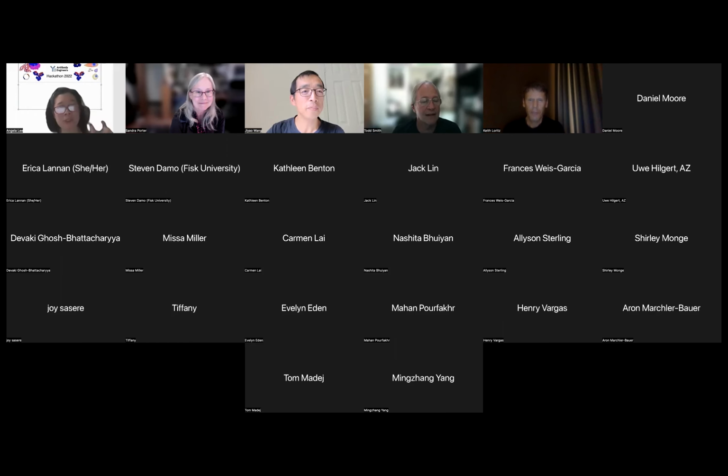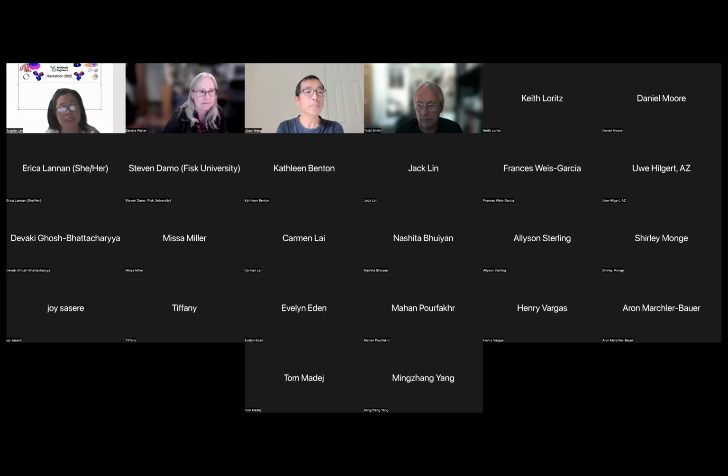Sure. In the beginner section, you had on your slides for P53, the select on 3D, and you could select by chain, 3D domain, strand helix, residue, atom, none. I can show it on screen if you want. Sure, go ahead.